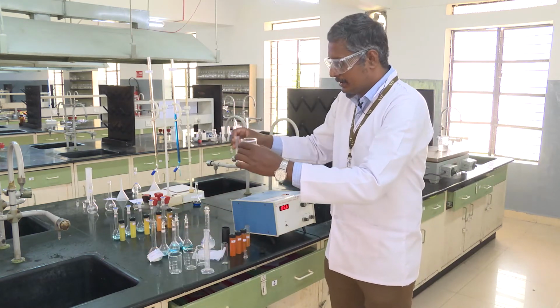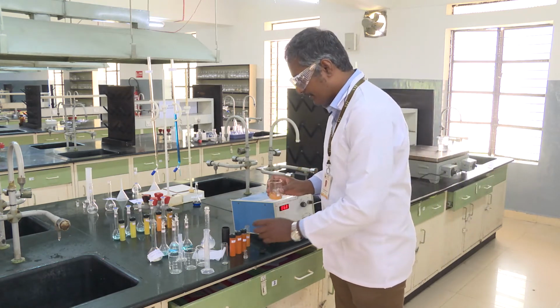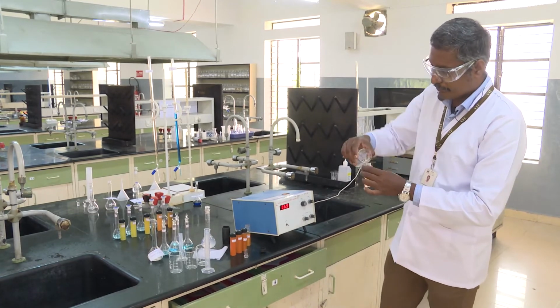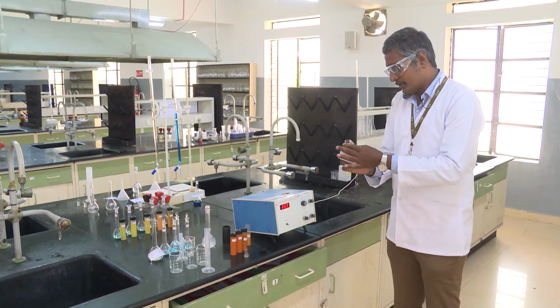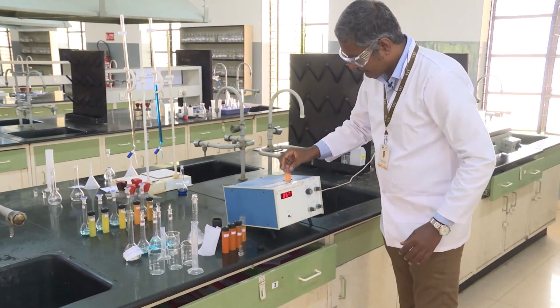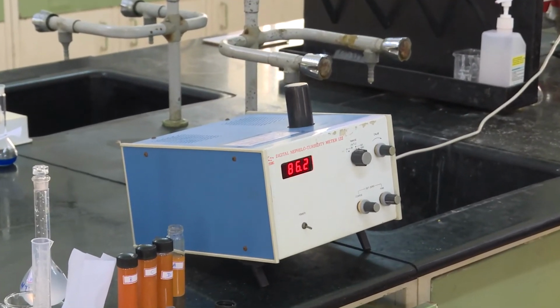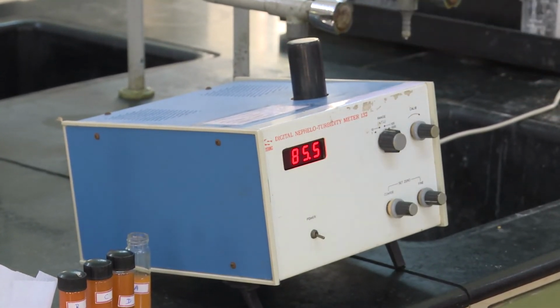So this is the A solution, 10 ml, and then 10 ml of the conditioning agent, and then transfer it to the tube. Then we need to clean this tube because it should not contaminate the instrument. Then put it back, cap it, and note down the values. Okay, so in this case 86 NTU is the value for the concentration A.